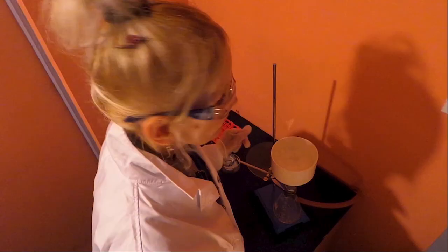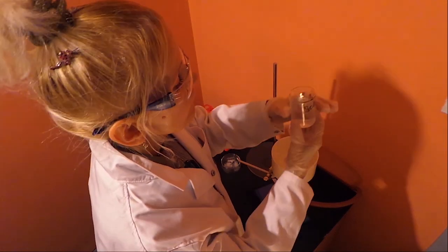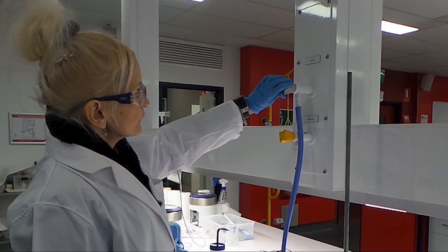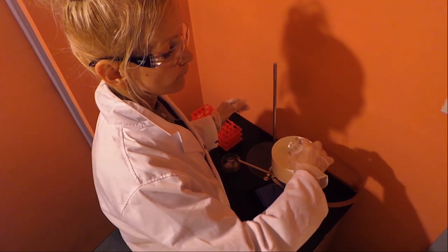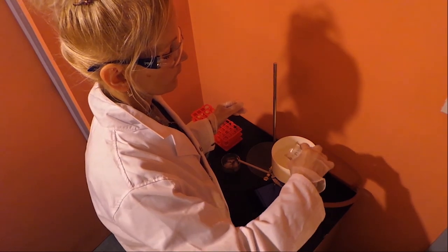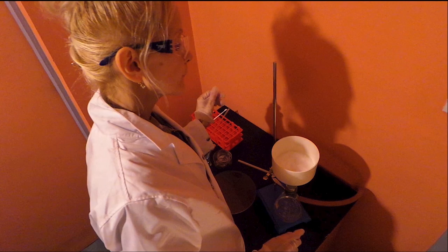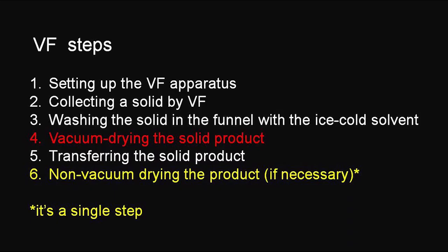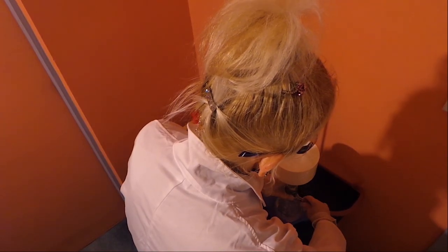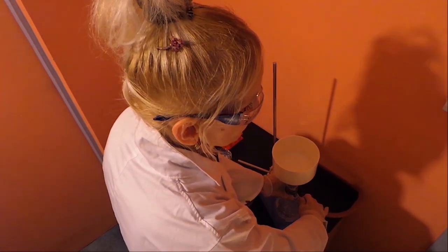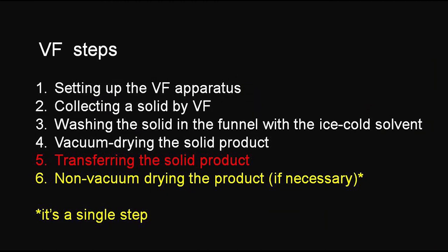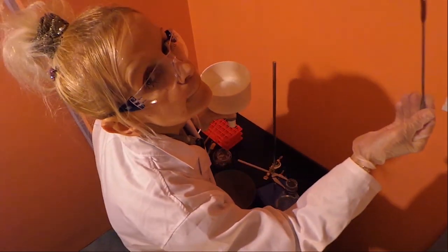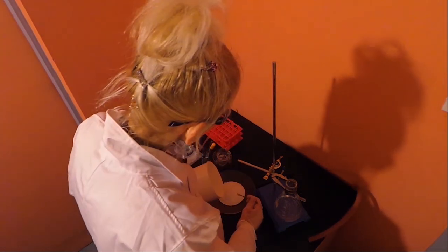Once all mother liquor has passed through the filter medium, we can start washing the solid in the funnel with ice-cold solvent. Reduce the vacuum and pour a small portion of cold solvent onto the solid, then apply vacuum. Repeat two more times to ensure all impurities are removed. Dry by continuing to pull air through the solid product for about 10 minutes. If no trap is used, disconnect the tubing from the filter flask before turning off the vacuum. To transfer the solid product onto a watch glass, take the funnel off the filter flask and use either forceps or a spatula to slide the filter paper onto the watch glass.